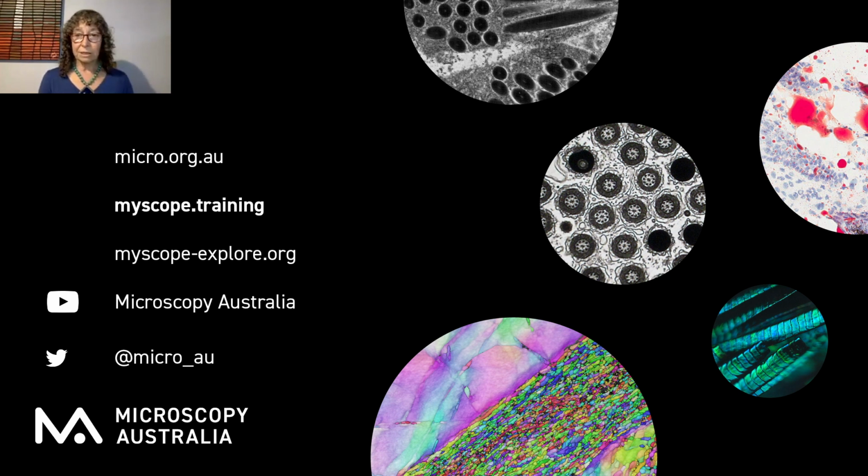I will at this stage just make a comment that I had a notification from someone just the other day that the SEM focus and astigmatism wasn't working on Chrome. It had previously worked on Chrome, but they update every 6 weeks or so, and the current version of Chrome out there does have this problem. Our developer's been working on that, but hasn't been able to solve it, although he said as a developer, he can get access to the next version of Chrome, and it doesn't have that problem.